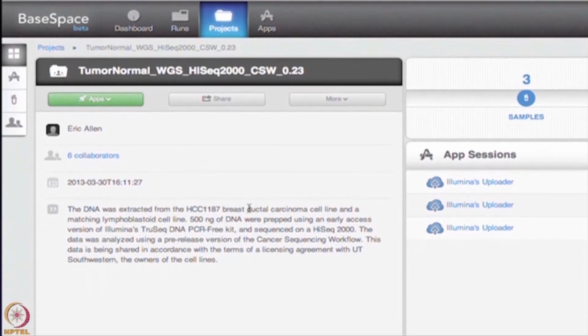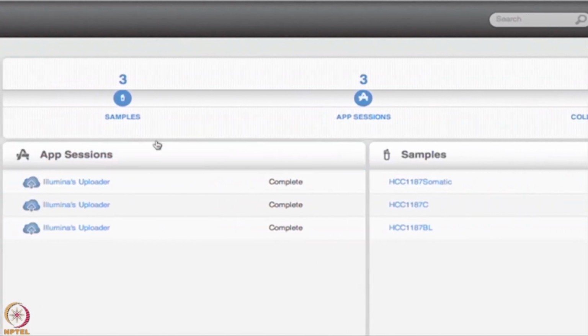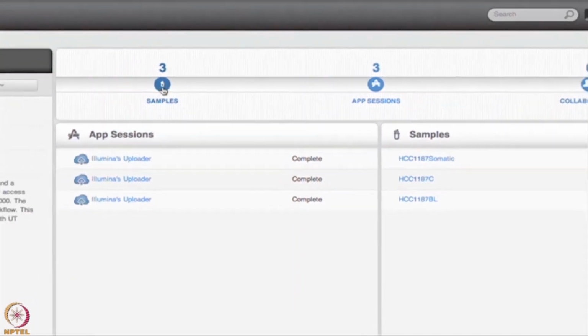The project overview page contains a brief description of the dataset. You can navigate around using the quick launch buttons, either using the buttons on the left tab, using the names, or the direct links. These all link to the same place.